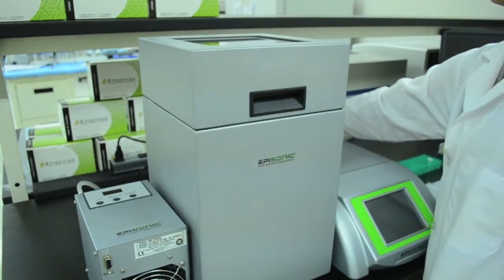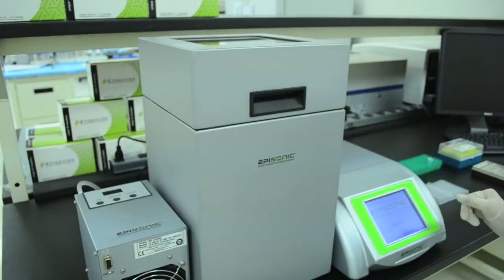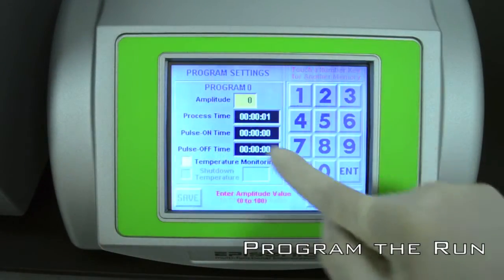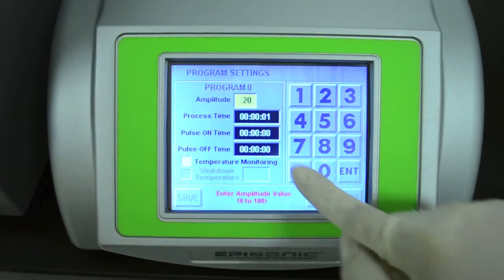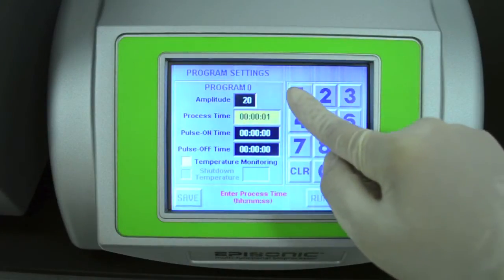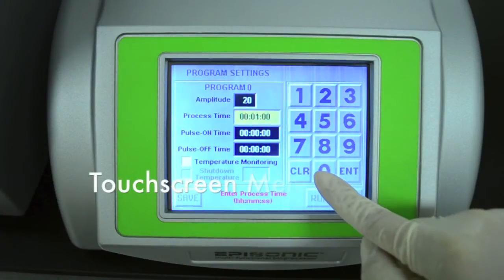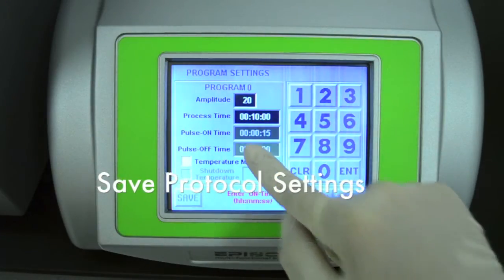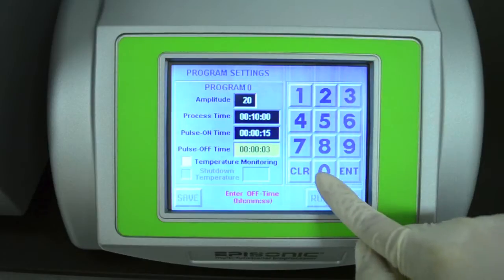Now, turn on and boot up the Episonic. Here, you are programming the settings according to a pre-optimized protocol or your own customized protocol. The touchscreen menu is easy to use and allows you to save multiple protocols so that you can reproduce the exact same run at the touch of a button.